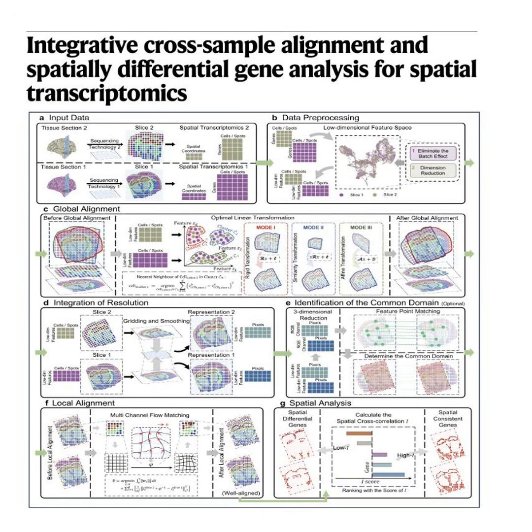So you end up with multiple maps of the exact same biological city, but one map is printed upside down, one is stretched out of proportion because someone pulled the tissue too hard, and one has massive microscopic tears separating the neighborhoods. Yeah, it's a mess. And if you want to compare a healthy slice to a disease slice, you have to align them perfectly. But traditional alignment methods either only do rigid rotations, like just spinning a piece of paper on a desk, or they require massive supercomputer-level processing power to calculate how to fix the complex distortions. Which most labs don't have.